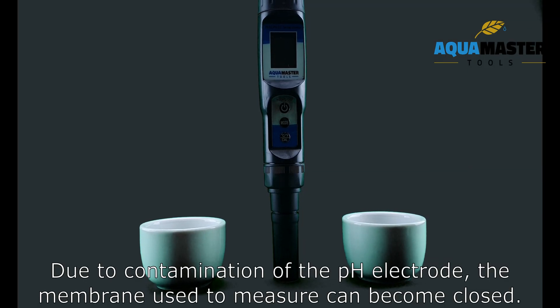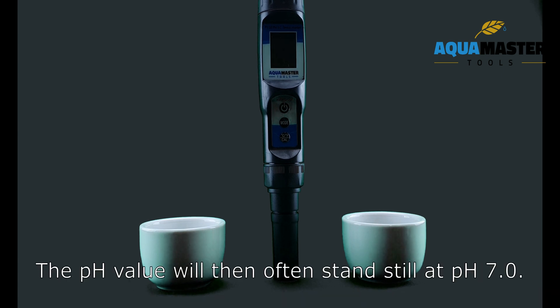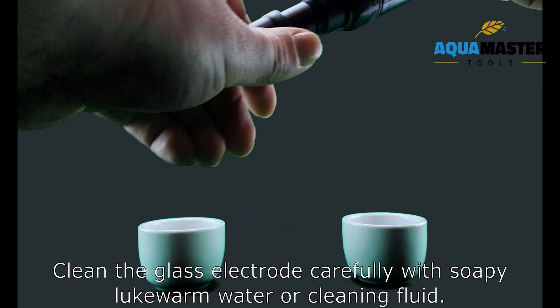Due to contamination of the PH electrode, the membrane used to measure can become closed. The PH value will then often stand still at PH 7.0. The cause of this is usually lime or algae scale.